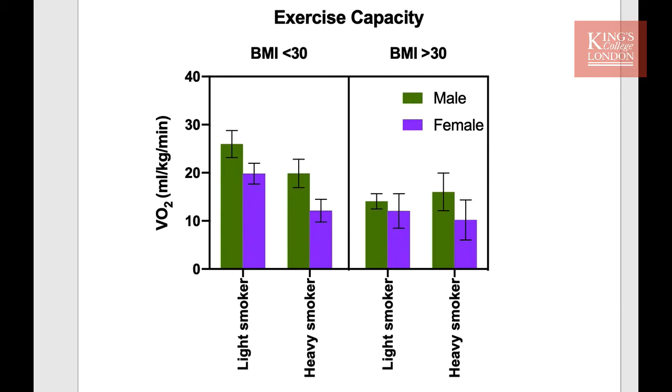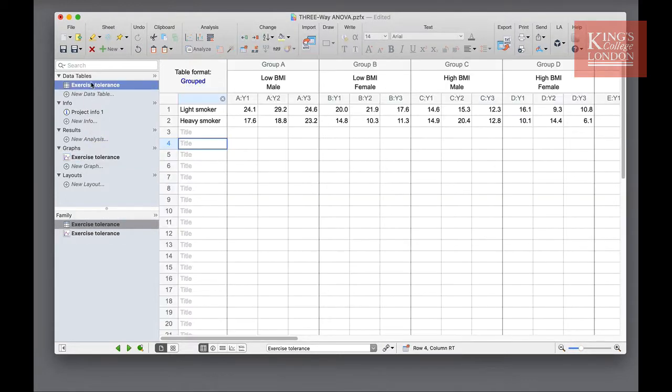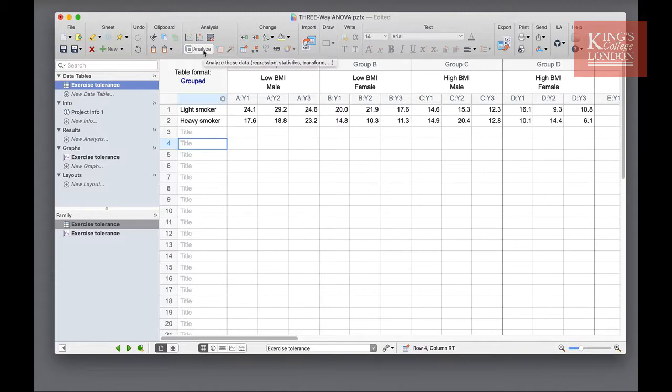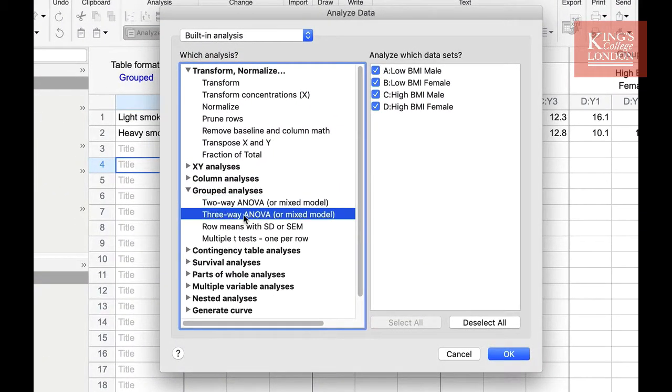This requires a complex analysis and the three-way ANOVA allows us to analyze this data set. Once you have entered and plotted your data, go to the data table and click on the analyze button in the analysis toolbar and choose three-way ANOVA or mixed model from the group analyses drop-down box.